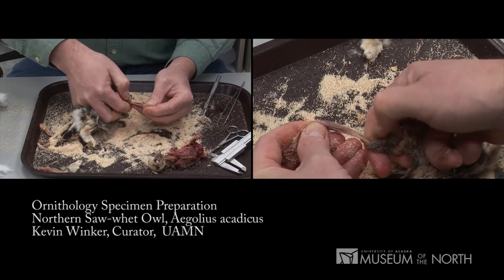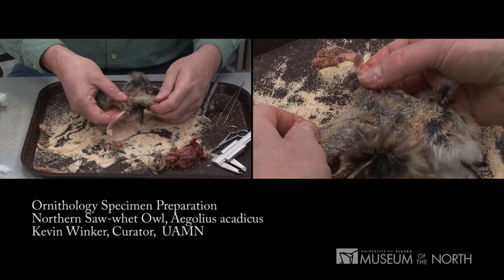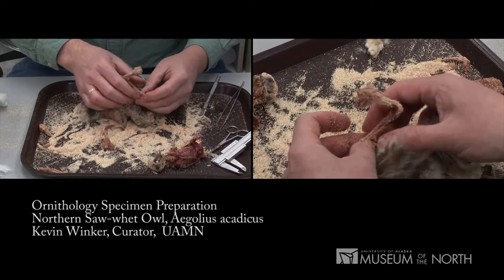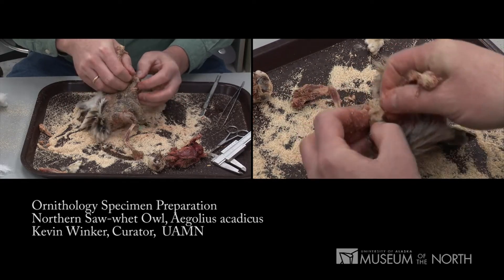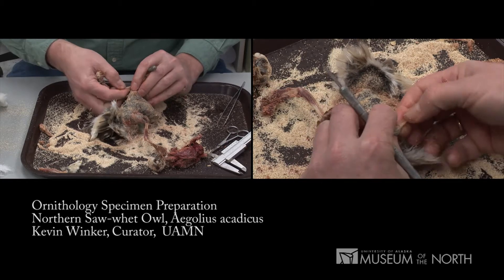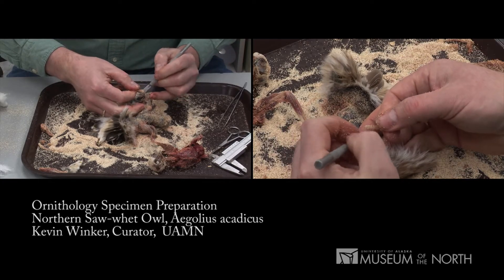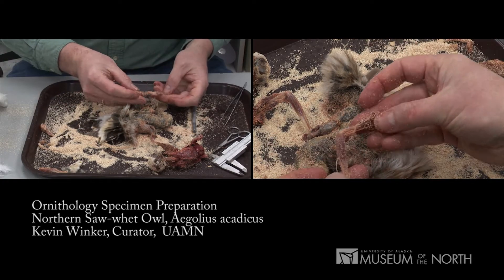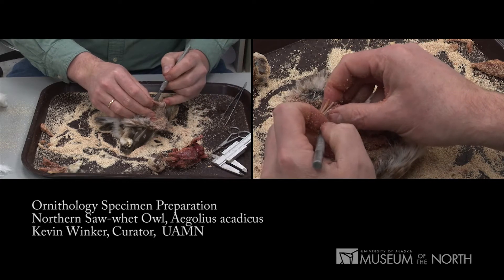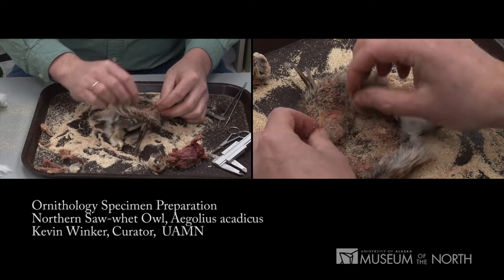Pushing away those secondaries from the ulna is critical, or it'll rip the wing skin. As with the legs, I'm going to make a decision on which wing bones to keep with the partial skeleton and which to keep with the skin. Because both wings are whole, that's an easy decision. I'm going to disarticulate the right wing at the wrist, which will give us a complete radius and a complete ulna for the partial skeleton. I don't need that radius and ulna from the left wing for the skeleton, and their presence will give us a wing that's fully comparable to historic museum specimens.